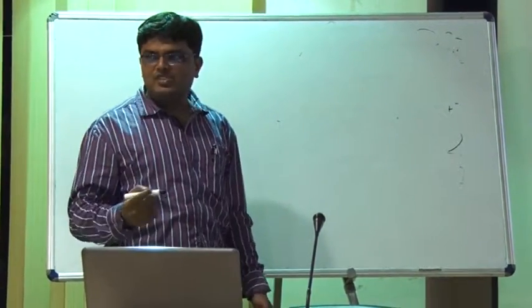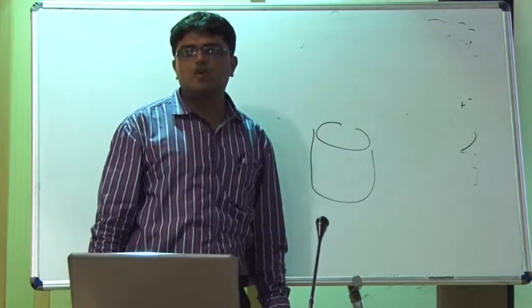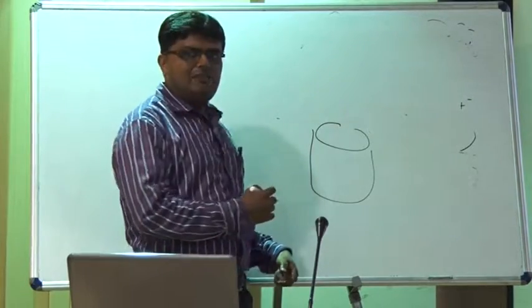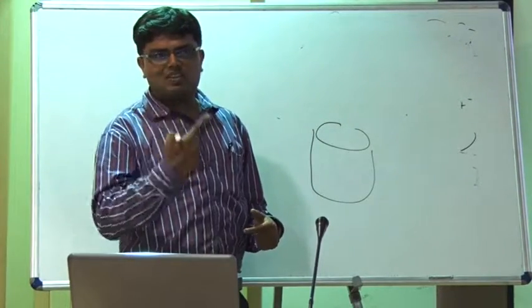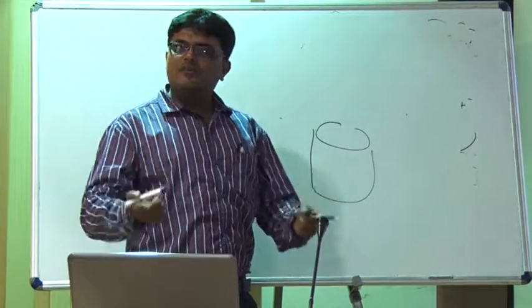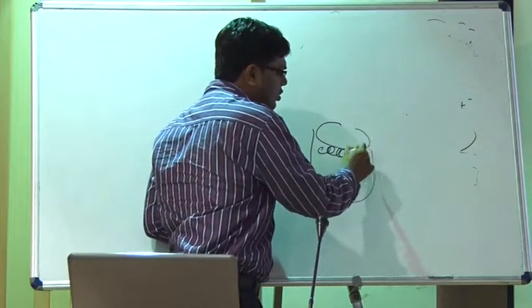The meaning of foaming is what? For example, this is your reactor, and you are working over here. Whenever you are working in a reactor, due to the movement of your impeller, foaming is going to occur. Whenever the foaming is occurring, it is going to behave like this. Are you able to see it?